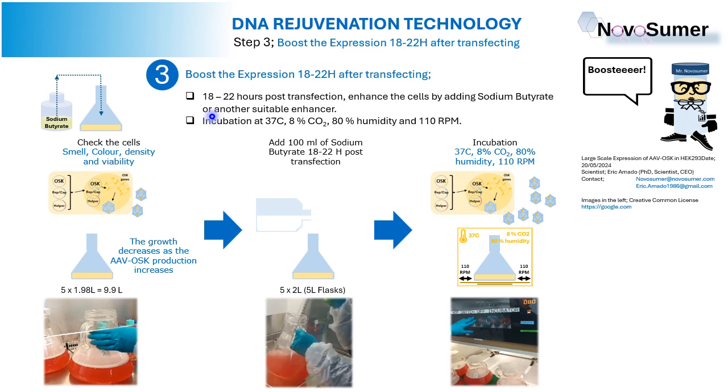After 18 to 22 hours after the transfection, we enhance the expression by adding sodium butyrate or another booster, another enhancer. They are called boosters or enhancers.